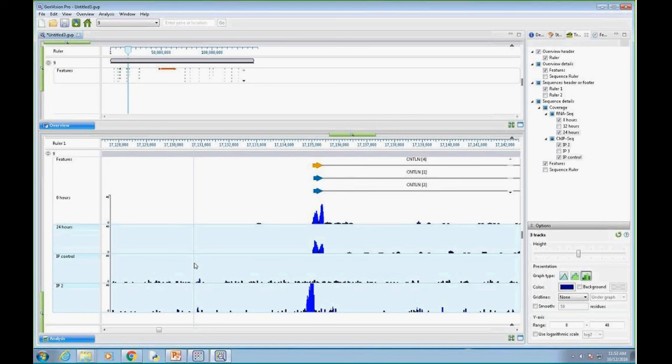My recommendation, though, in general, is to reassemble, because we continuously improve our SNP detection and our peak detection. Those get better with the later software. So if you're going to cross-compare, because the assembler is so fast, it's very easy just to reassemble. So my first advice would be to reassemble, but if it's relatively recent, version 13, then by all means, you can combine them.